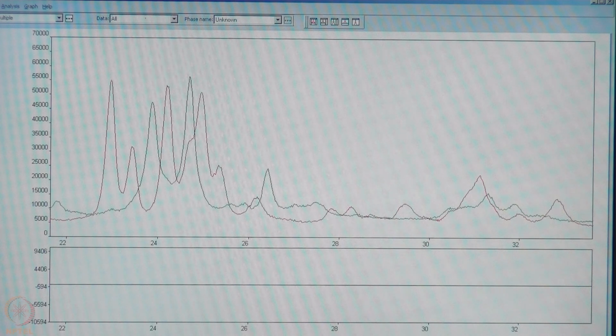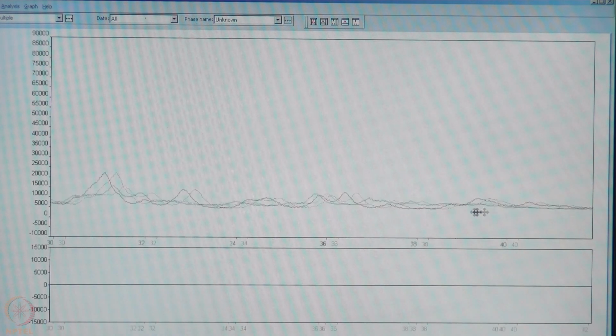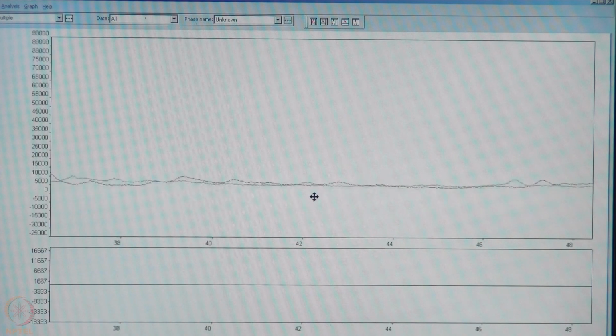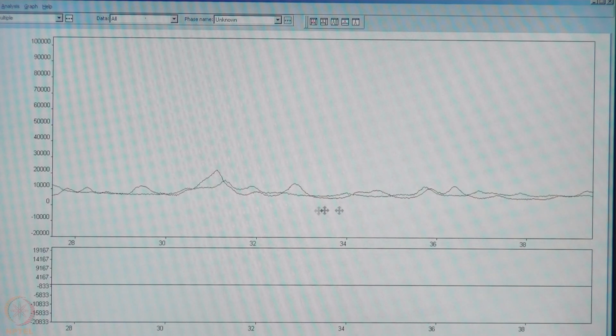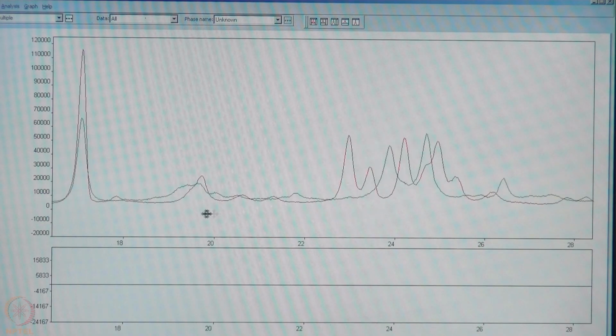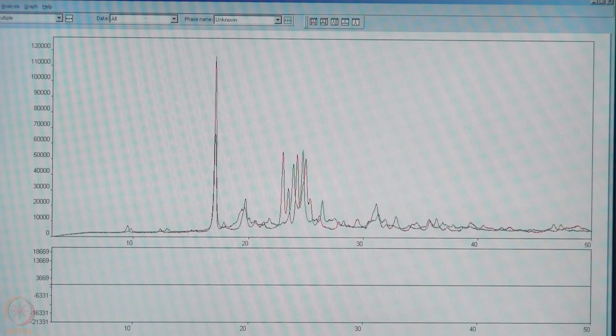This particular case, where the sample we know has originated from one particular compound and is giving two different crystal structures with two different sets of peaks appearing at two different points. So, this is how one can identify polymorphs using powder X-ray diffraction data.